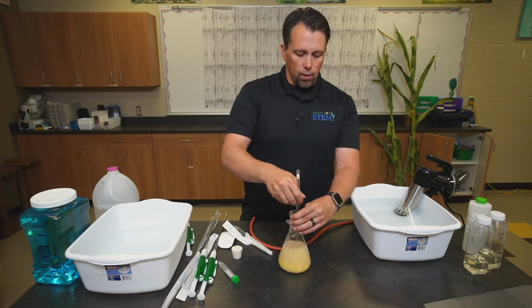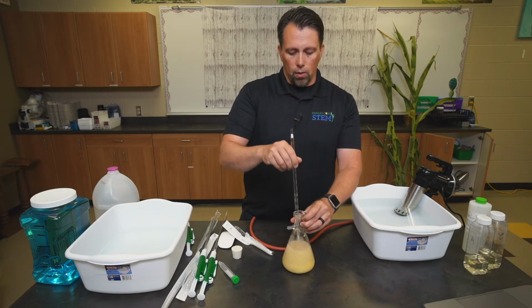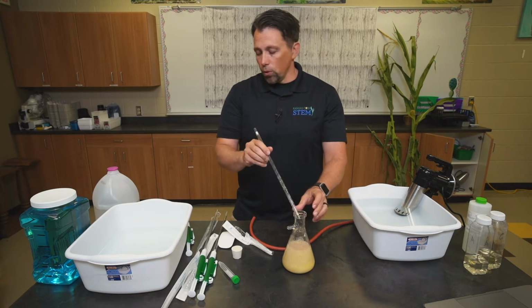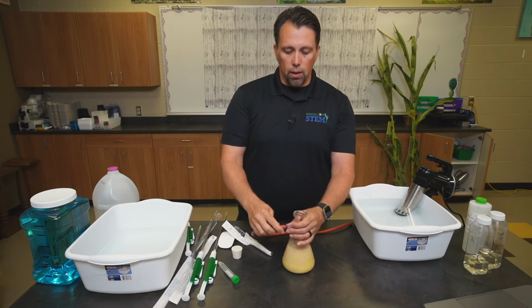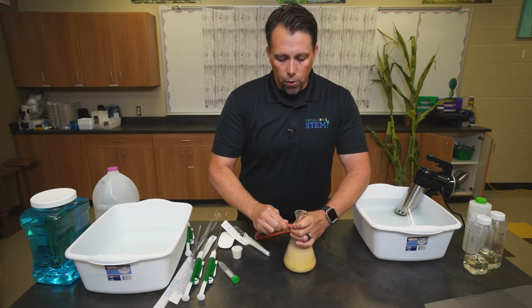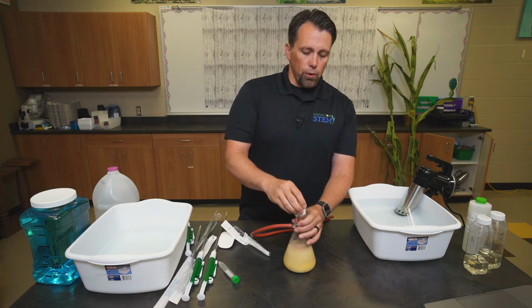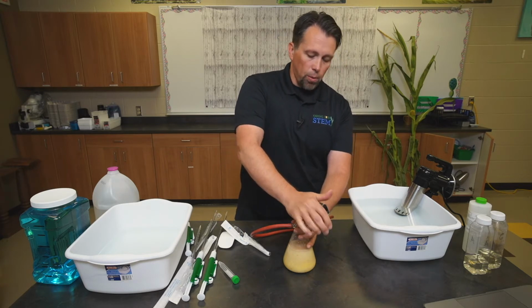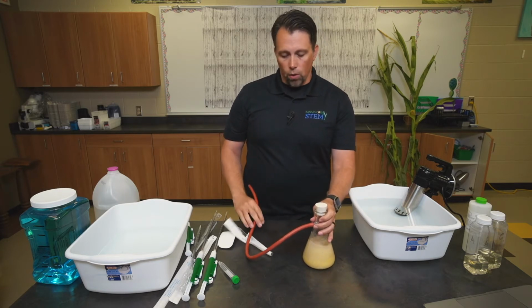It has the yeast, the enzymes to break down the starch, and again, just like fermenting fuel, just on a larger scale, we want to be able to collect the carbon dioxide to estimate how much ethanol we've produced and see who made the most before we distill it. So if you're using a filtration flask, put a rubber stopper on here. This is some of the tubing that came with the distillation kit, so you can use whatever tubing you need.